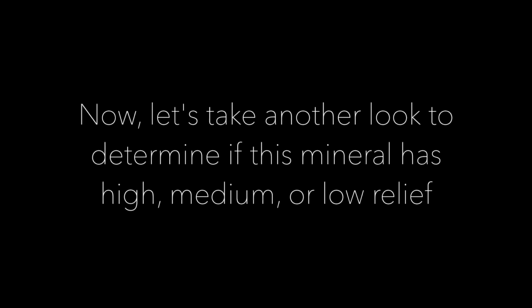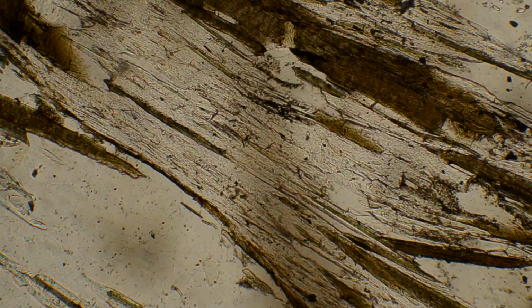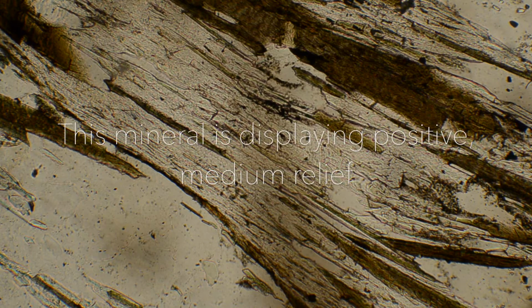Now, let's take another look to determine if this mineral has high, medium, or low relief. This grain boundary is not very faint. It is also not very pronounced. Therefore, we can say that this mineral is displaying positive, medium relief.